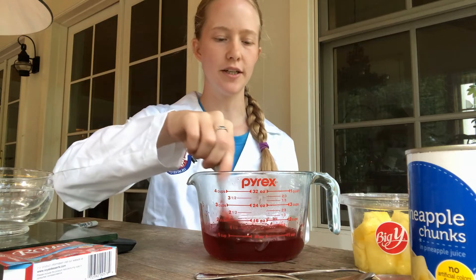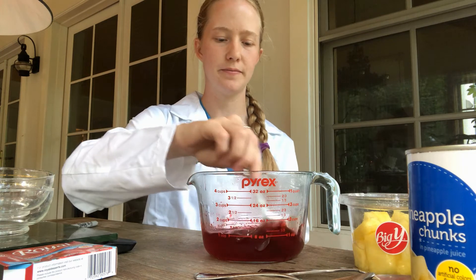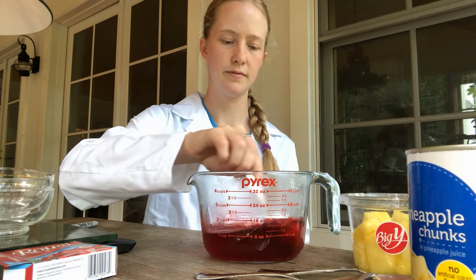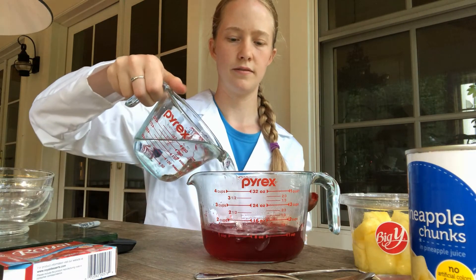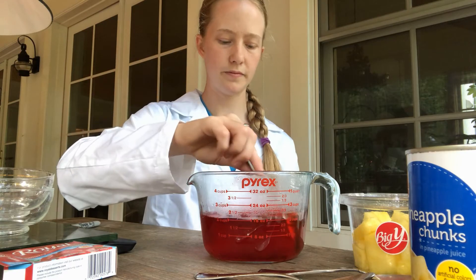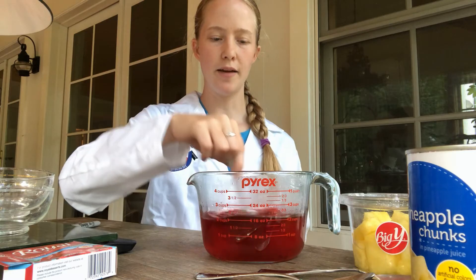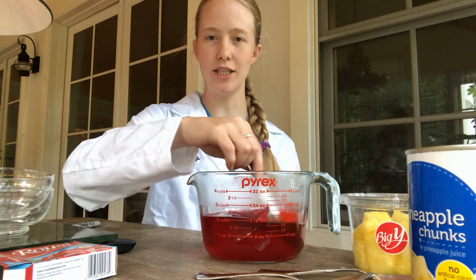Luckily I'm not allergic to any of these materials, which is another safety consideration whenever you're conducting a lab. Now that I've prepared my gelatin mixture, I'm going to measure out the pineapple and then distribute the appropriate pineapple and gelatin to the cups.